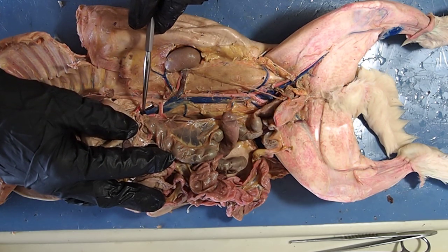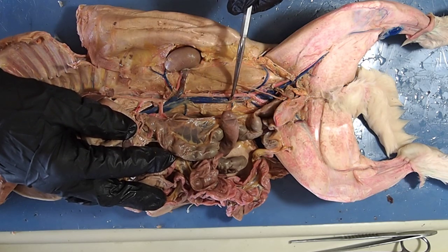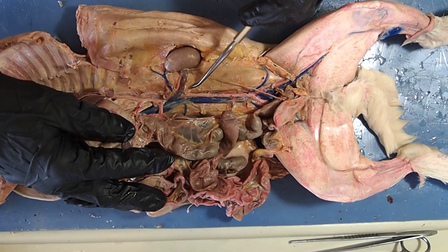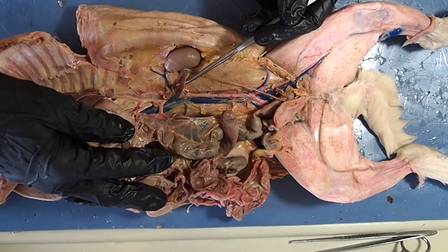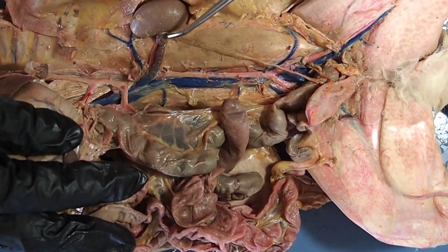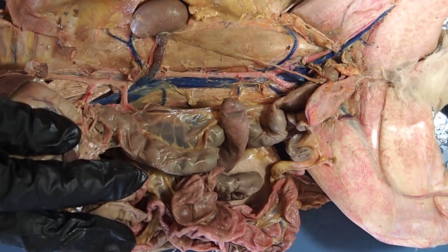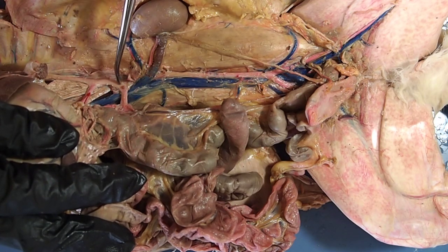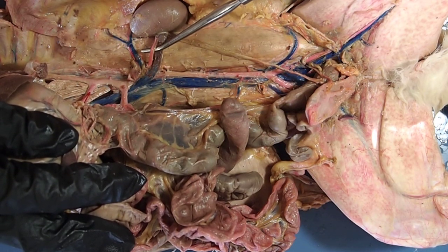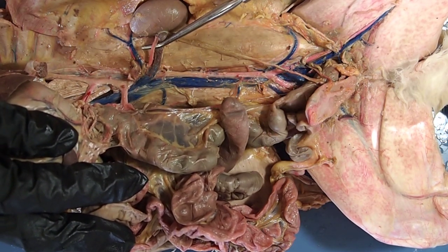Notice this big blue blood vessel coming on down — this is my inferior vena cava. A branch of the inferior vena cava goes over to my kidney; that blue blood vessel going to my kidney is the renal vein. The deoxygenated blood from the kidney collects in the renal vein, travels to my inferior vena cava, and goes back up to the right atrium of the heart. Coming down the abdominal aorta, there is a small red blood vessel going to the kidney — this is the renal artery, supplying the kidney with oxygenated blood.